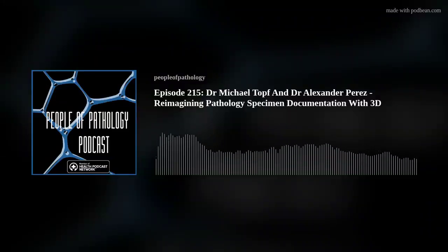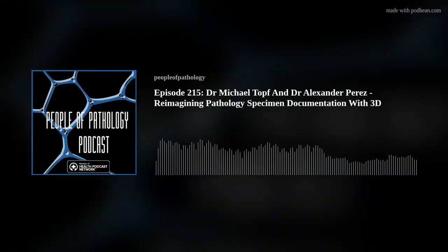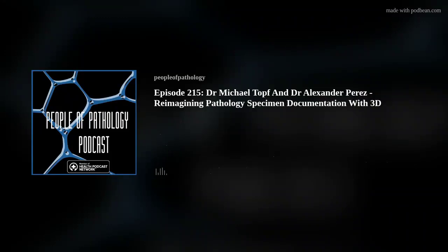Yeah, as you were saying that, again, I can relate to all of that, and you're completely right. And listening to it out loud, it seems like, of course, there should be a different way to do this. This really isn't the most accurate way to describe a specimen. And of course, once you gross a specimen like that, you can't go back to it because it's sectioned pretty well. A lot of times you can't really put it back together.